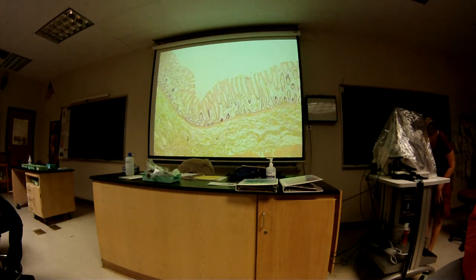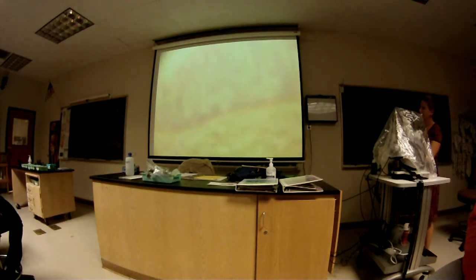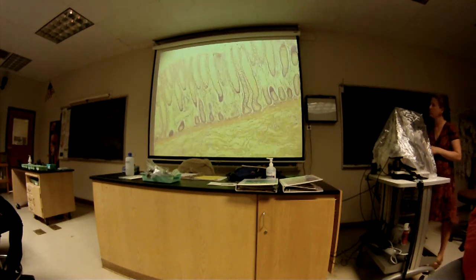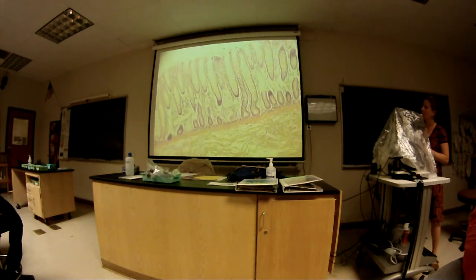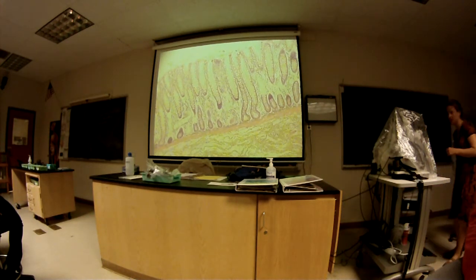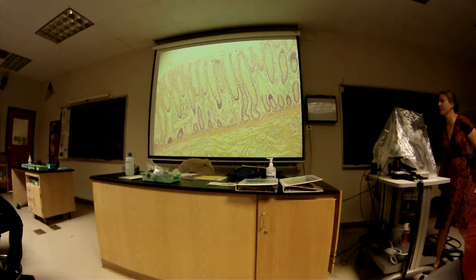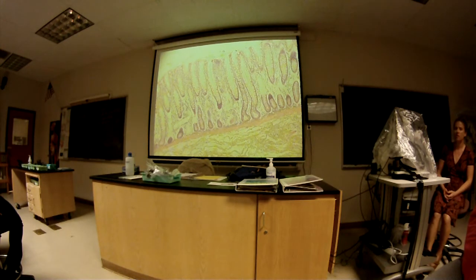Aren't you going to ask us what this is, the gallbladder, the stomach? How can we really tell what organ it is? The colon's probably one of the tougher ones to identify, but you're looking for structures as well as lack of structures. So, do you see villi in the mucosa? No. So you know it's not the small intestine.